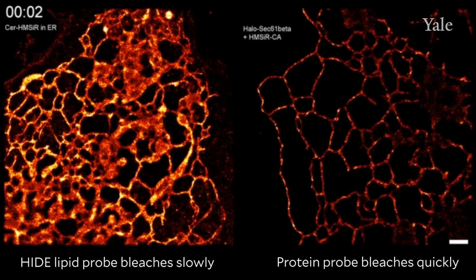We realized that two problems had to be solved. First, we had to figure out a way to label the dye very densely, and second, we needed to figure out a way to keep the dye from self-destructing. And the trick is to link the dye to a lipid, the greasy molecule that forms the boundary around almost every organelle in the cell.